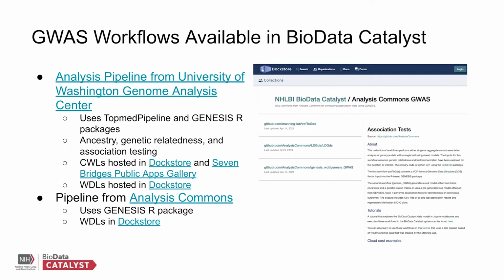And I've linked where the CWLs and WDLs are hosted, both in Dockstore, and CWLs are also available in Seven Bridges. There's another pipeline that was developed by a group called Analysis Commons that also leverages the Genesis R package, and those WDLs are also available in Dockstore and linked in this slide.